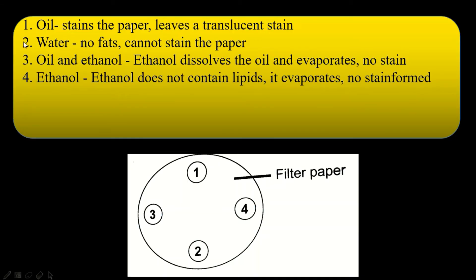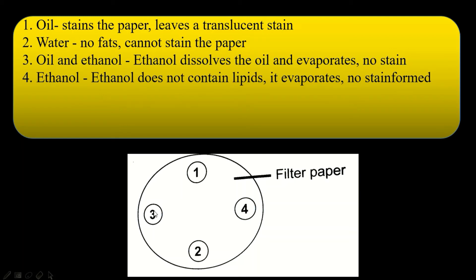At spot number two this is water. What happens when you pour water on a piece of paper? Your paper will dry off and you won't even notice whether there was water on that spot or not. For example, when you wash your clothes, after washing there is no stain left — because you used water and water does not contain fats.